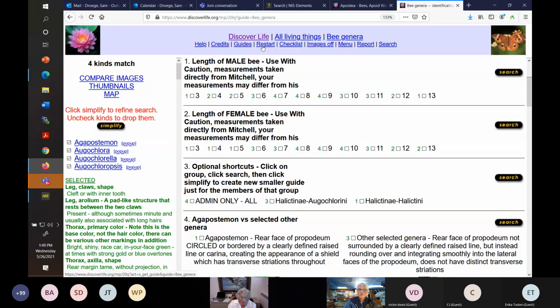Or after a while, it's like, I know that this is a honeybee. They go over there. And then I know that this is Bombus impatiens. They go over here. And you start narrowing down the possibilities, and you gain experience, similar to bird watching. Oh, I know now the robin song. That was like a robin song, but not. So maybe it's a scarlet tanager. So you're doing the same thing, but you can't just sit there and look at that robin all day long wondering what it is.